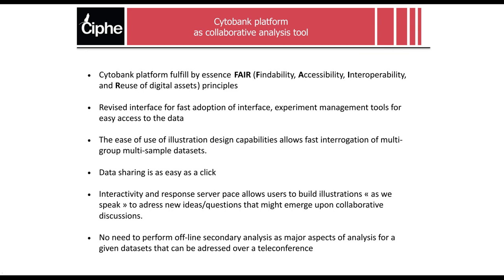And like this, you can solve technical questions and focus your TC time with your collaborator on advanced questions and building hypotheses, which is what we should really use this time for. And finally, because we no longer need to perform offline secondary analysis, we really solved all these little issues through the TC. So I'm now done.